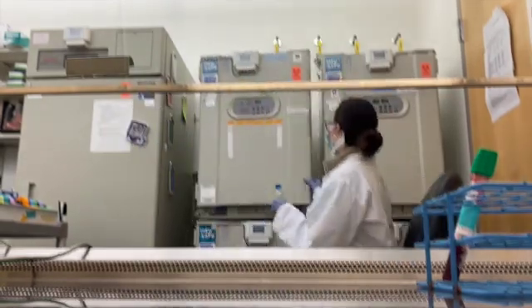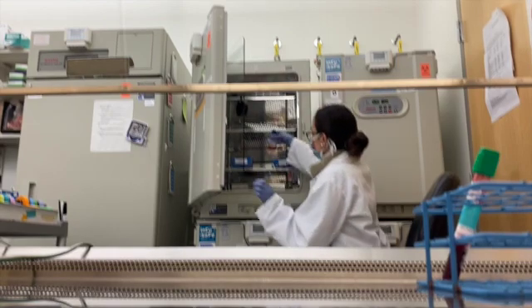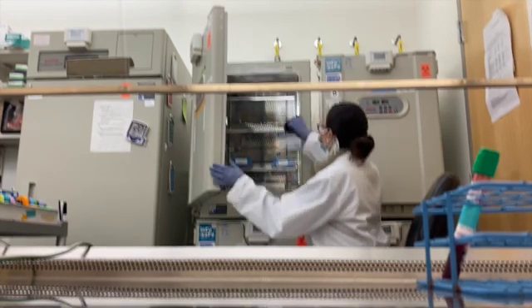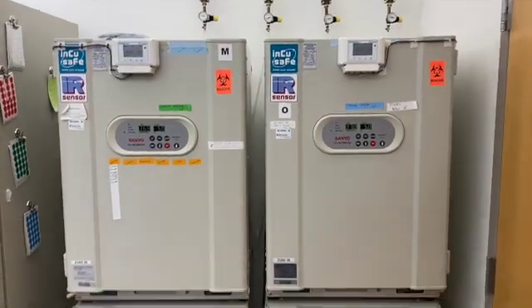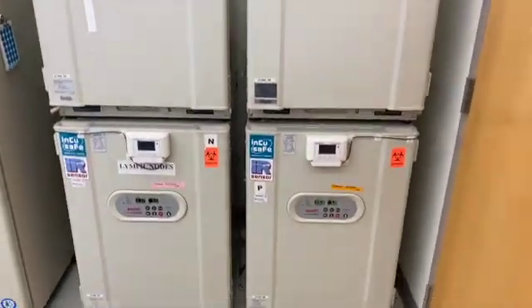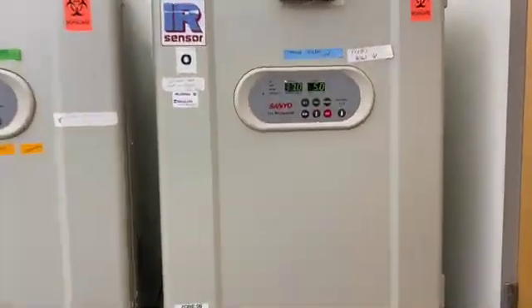the incubator. Incubators are an essential part of how we get cells to divide and proliferate in culture. If you set up 2 culture flasks on one sample, it's a good idea to put them in separate incubators to reduce the chance of culture failure due to contamination within the incubator or in the chance that an incubator stops working.